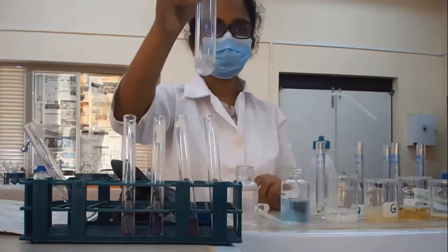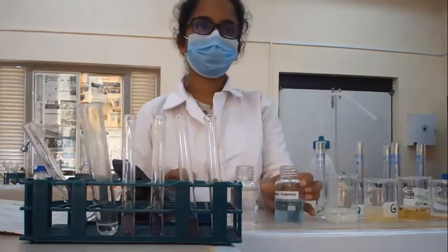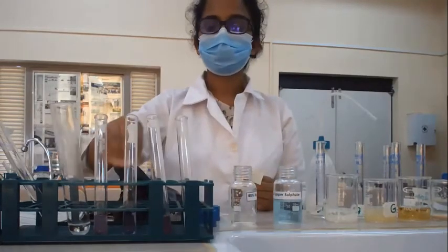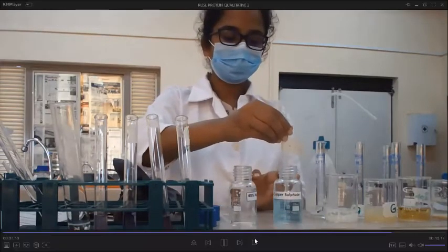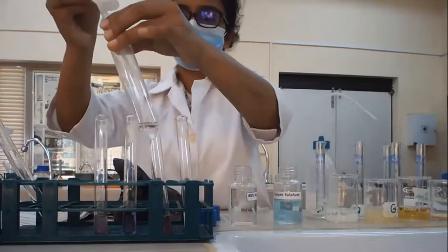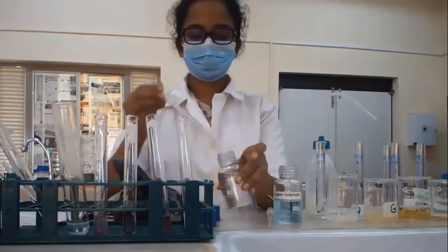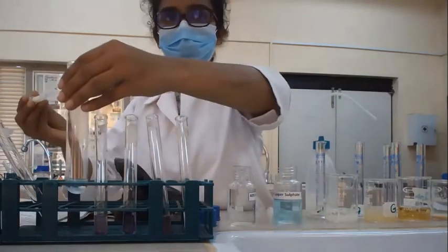Then for this urea sample, we are going to add a few drops of copper sulfate and a few drops of sodium hydroxide accordingly as we did previously for the protein sample. First, we will add a few drops of copper sulfate. Then we are going to add a few drops of sodium hydroxide.